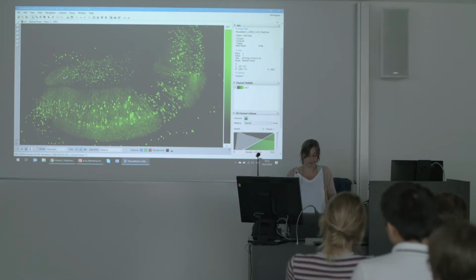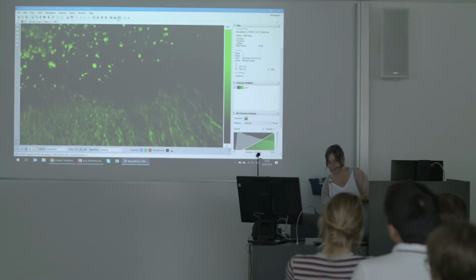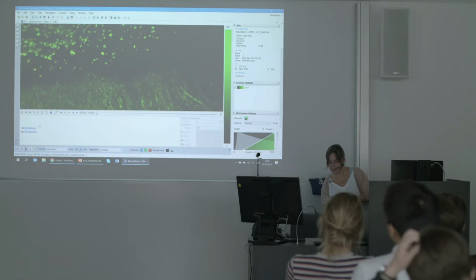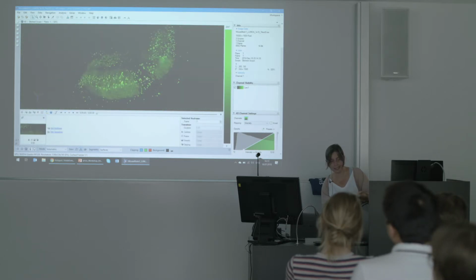Now, commercial solutions use different strategies, and ours is to free the user from running the software on large RAM, large memory-consuming workstations. Saying this, I could start working with this data, making a movie, making a nice animation, as we have seen in Ali's presentation before.